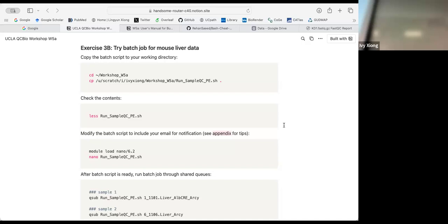So now the results of that filtering are in here. That's good.